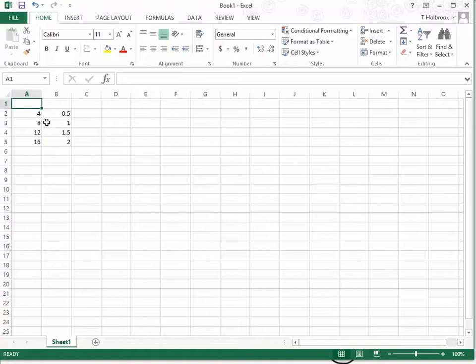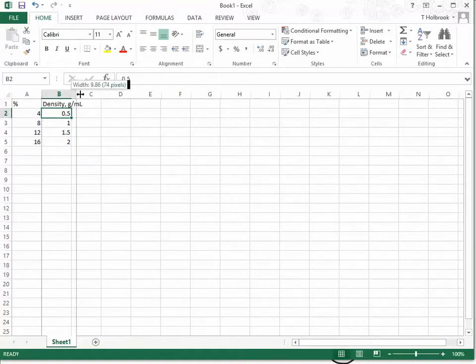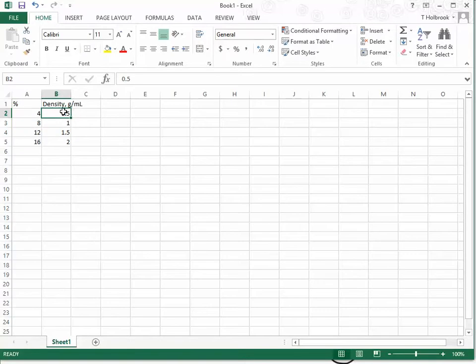And then up here at the top I can put concentration in percentage there so I know what that number means. And then here I can put density, or I can put D for density, and I can put a proper unit there if I want, gram per milliliter, so I understand what units are there with these numbers. See how it cuts off my unit up here at the top of the B cell, gram per mil. It feeds over into the cell next door.